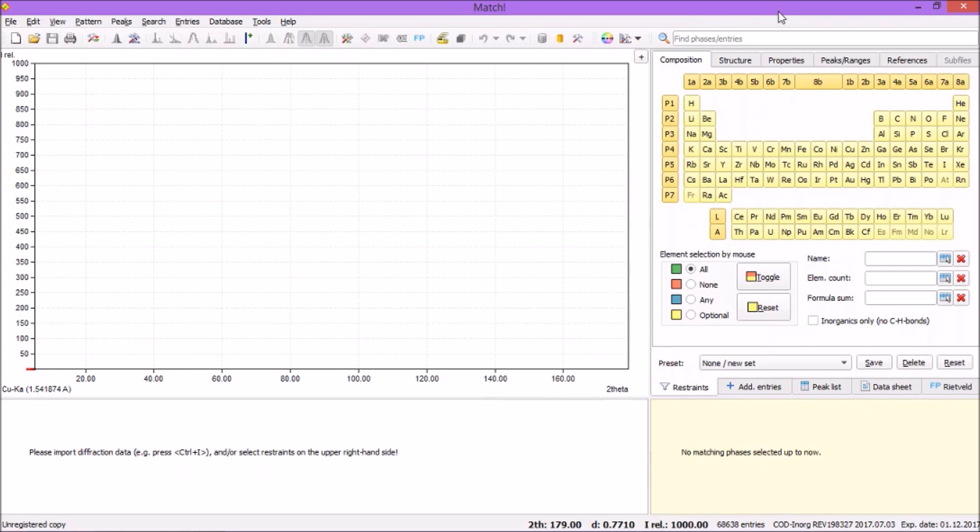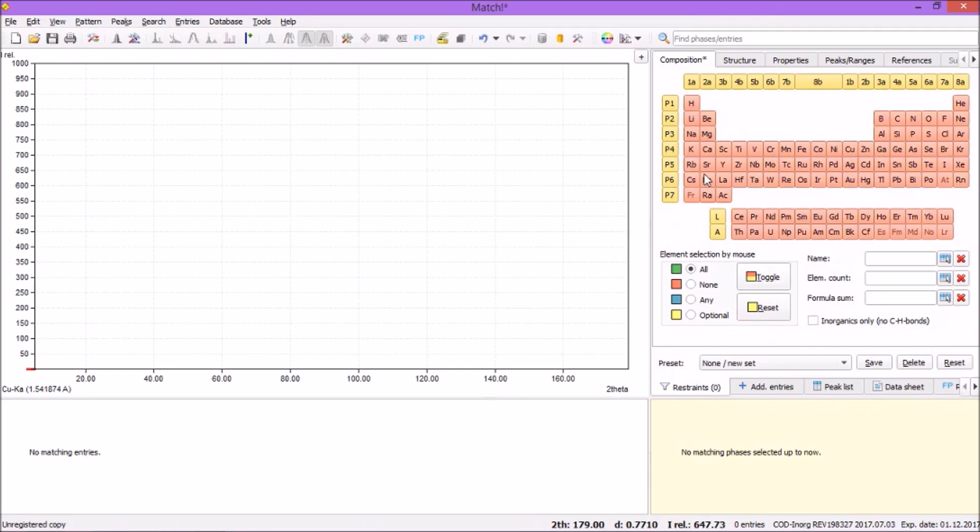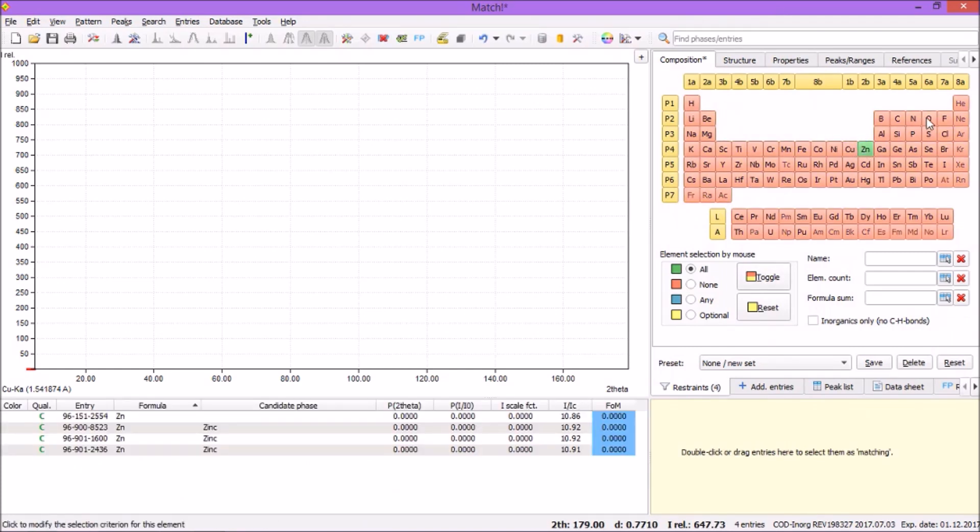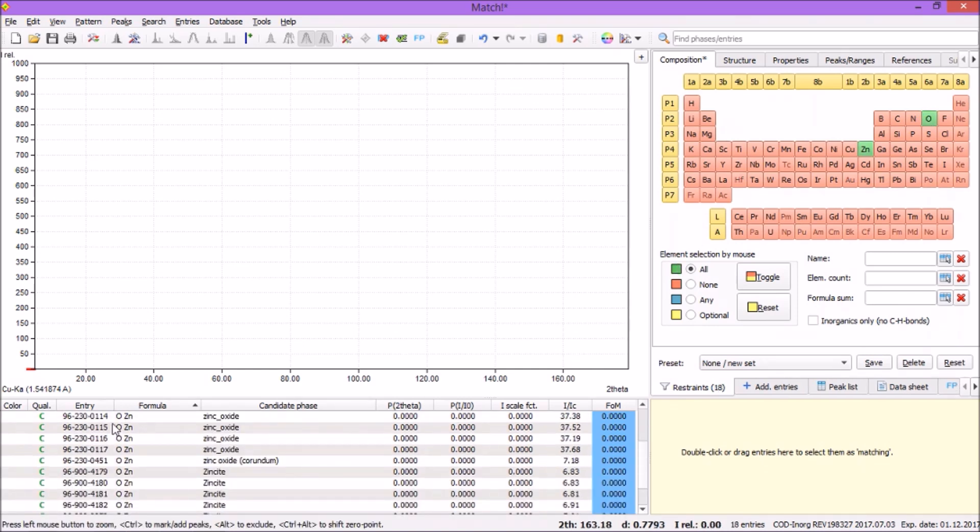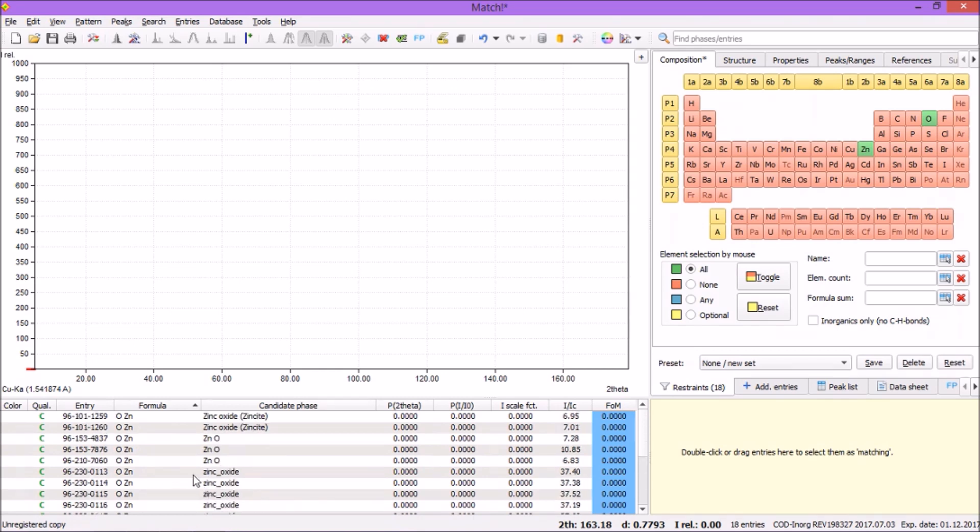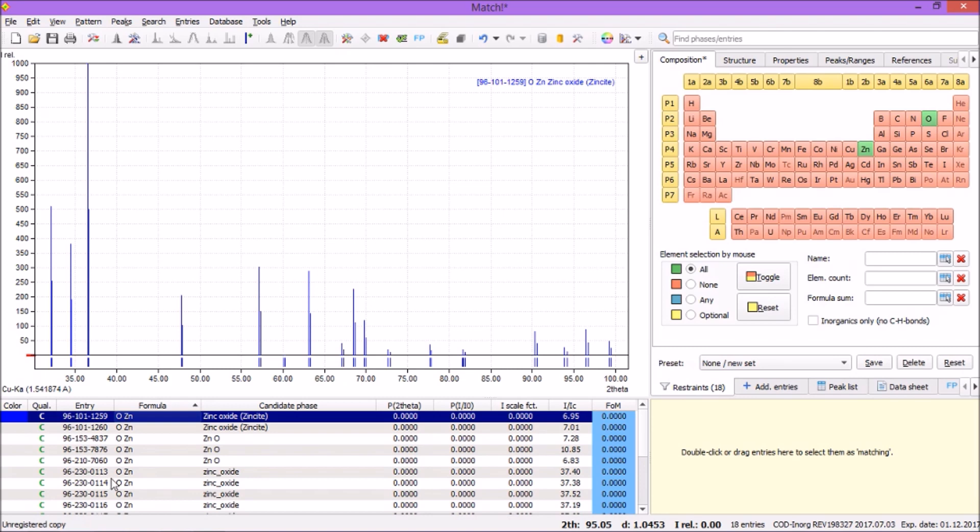Let me choose zinc oxide first. Toggle and select Zn and oxygen. There are lots of entries of zinc oxide, and suppose I want to have this one. I want to have this entry file right on my desktop.